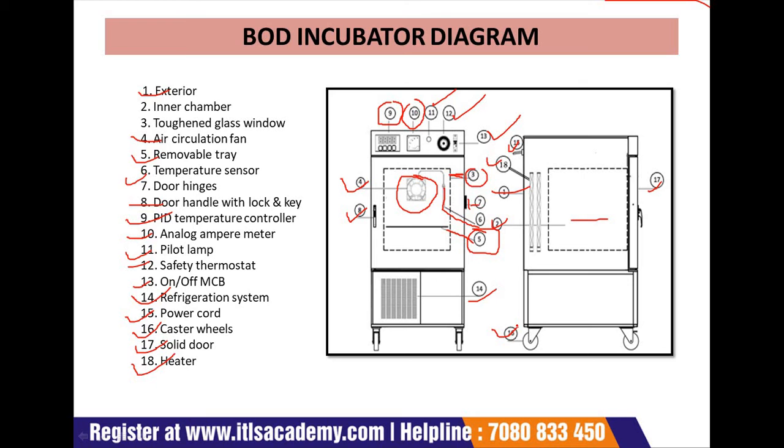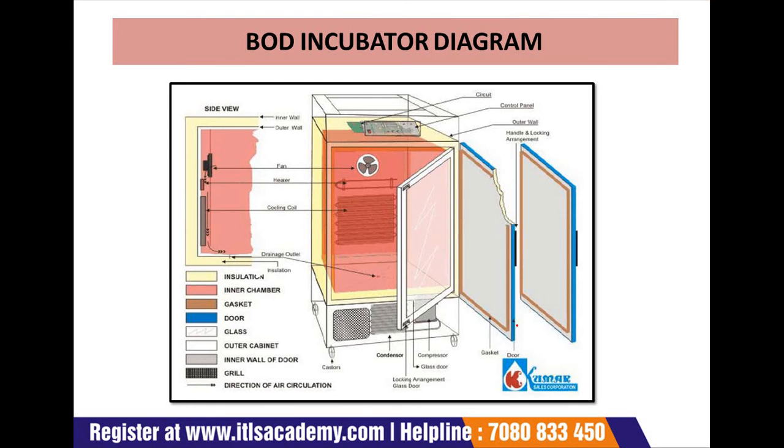Now we will discuss the BOD incubator diagram from the inner side. So in this picture you can see this color is showing insulation. This is the insulation, and this color is showing the inner chamber. And now this light brown color is showing the gasket. Here you can see it. This is the gasket.